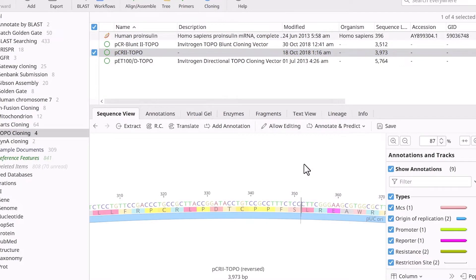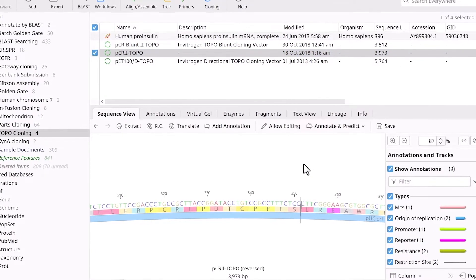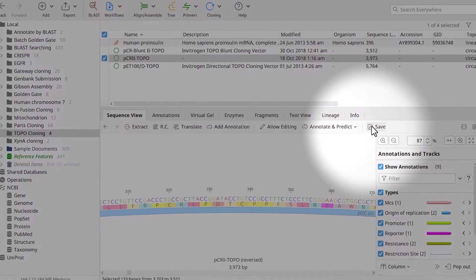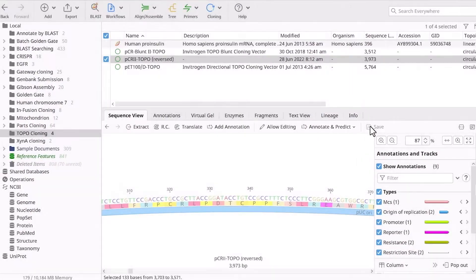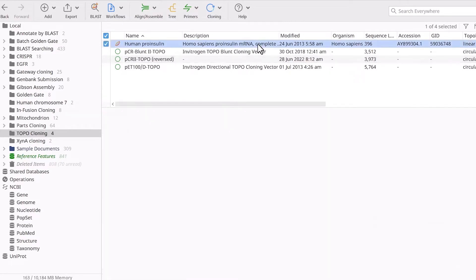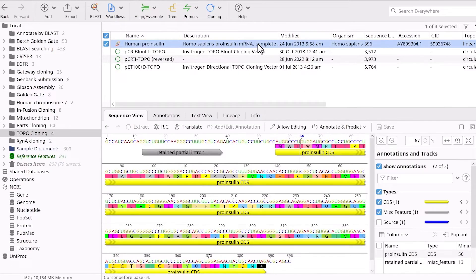This changes the promoter's orientation, allowing you to use it for expression later. Once updated, click Save to save the changes. So that's the vector file prepared. Let's now look at the insert file.